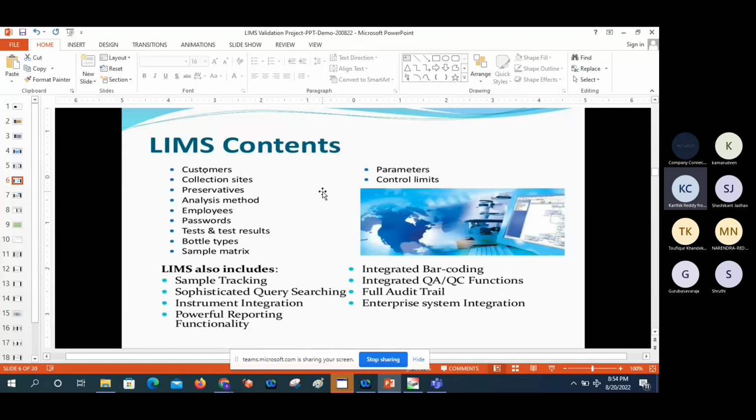If you are writing an ad hoc query manager, then we can get the necessary information on where the issue occurred. If you are not getting those kinds of scenarios, we need to approach the vendor. Why? Because they have more technical knowledge compared to the LIMS core team available in the current organization.